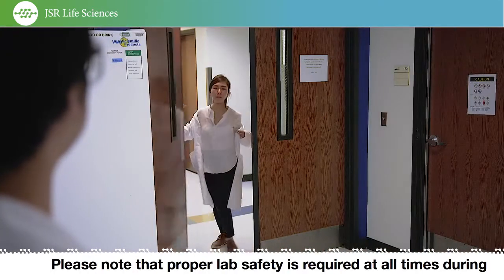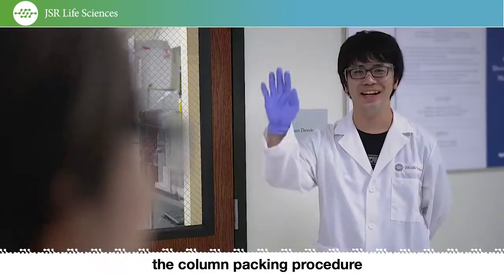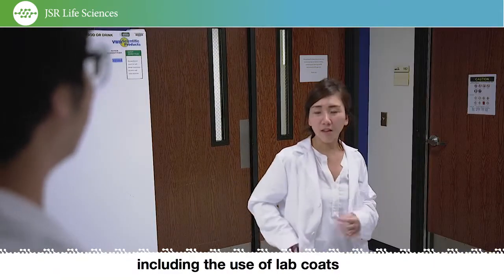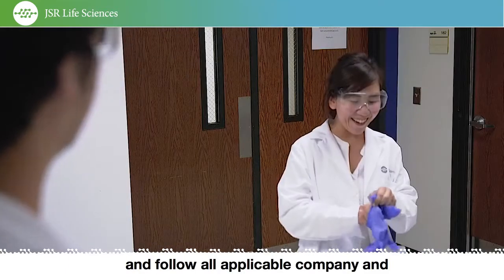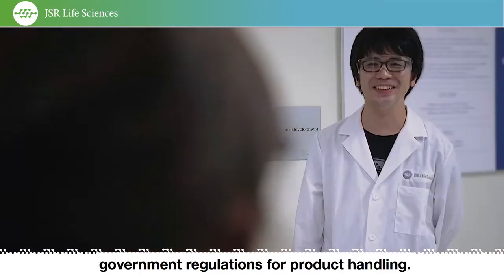Please note that proper lab safety is required at all times during the column packing procedure, including the use of lab coats, protective glasses, gloves, and follow all applicable company and government regulations for product handling.